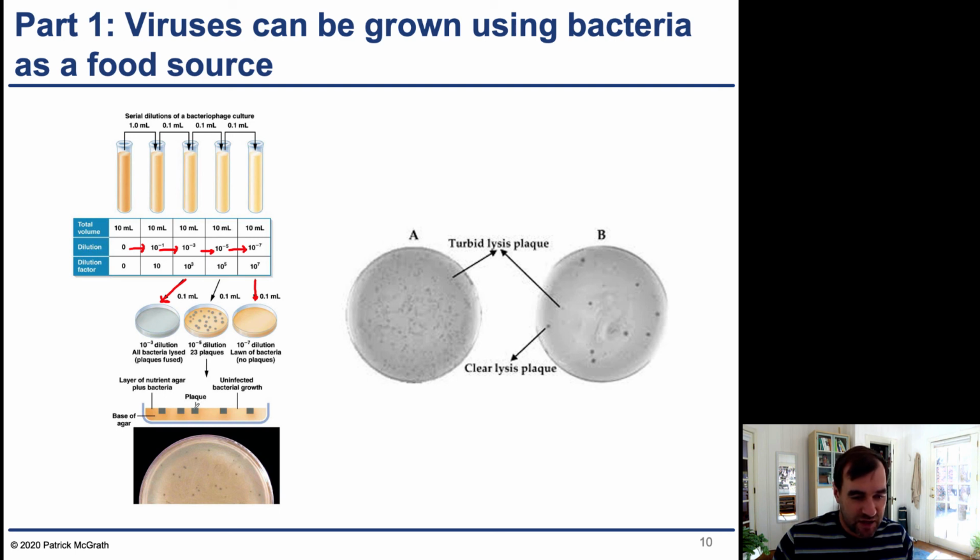This is just a density, a volume of dead cells. All of these plaques just contain dead, lysed bacteria. And these viruses continue to move out. Each of these viral plaques comes from a single individual viral particle, so these are the equivalent of colonies. And these plaques can have different phenotypes based upon how they look.